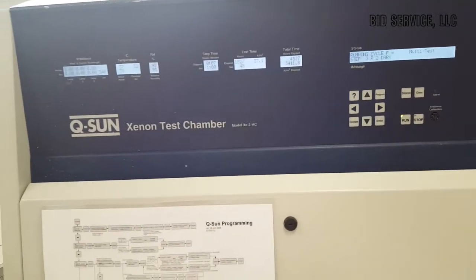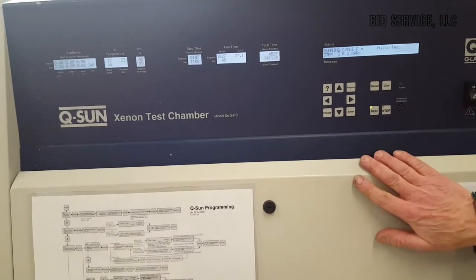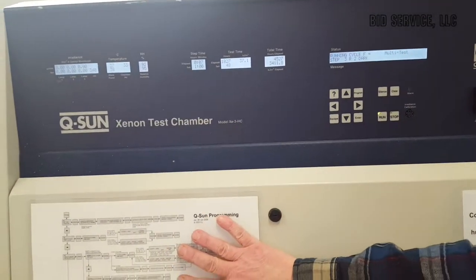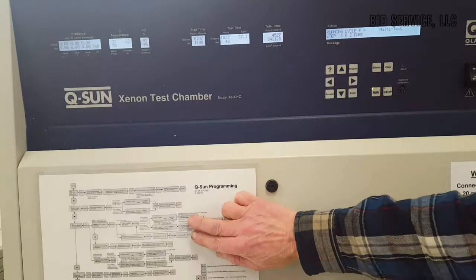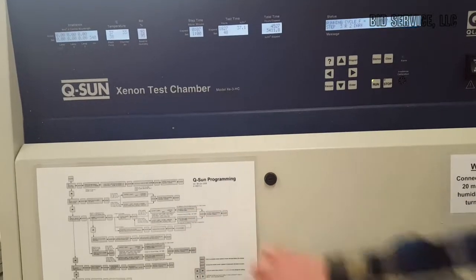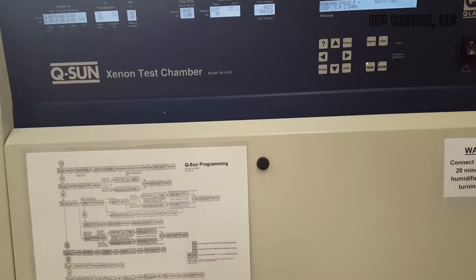So it's very simple to follow. Make sure you follow the programming chart. And if you need descriptions of any one of the different modes, they're clearly written in the book.